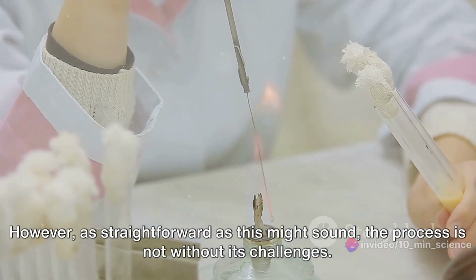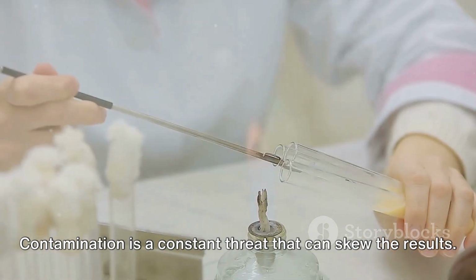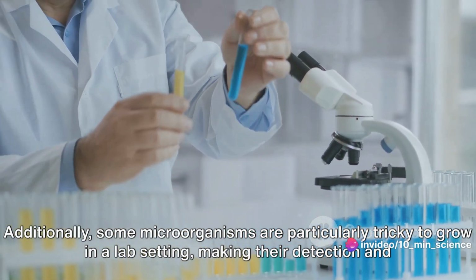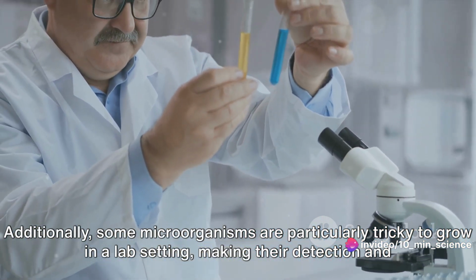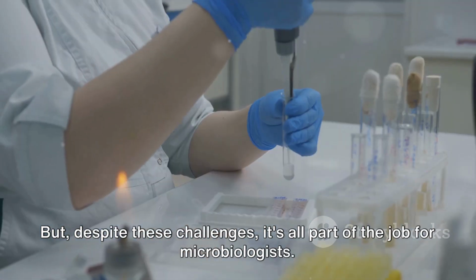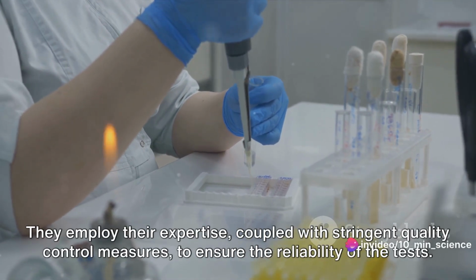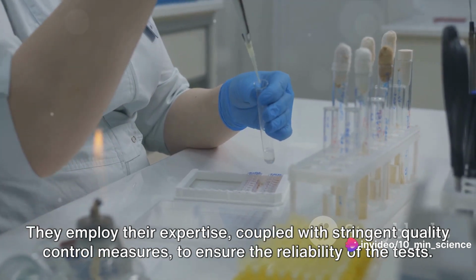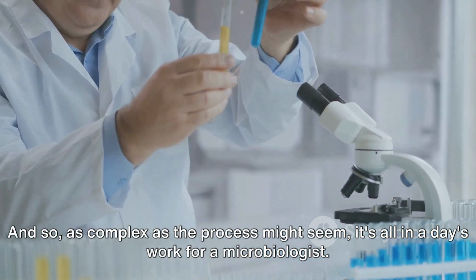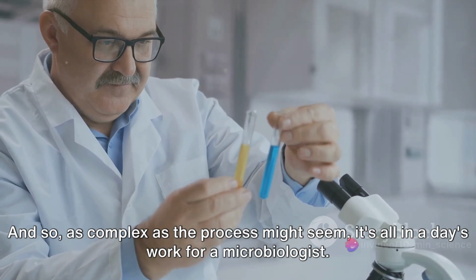However, as straightforward as this might sound, the process is not without its challenges. Contamination is a constant threat that can skew the results. Additionally, some microorganisms are particularly tricky to grow in a lab setting, making their detection and identification a daunting task. But despite these challenges, it's all part of the job for microbiologists. They employ their expertise, coupled with stringent quality control measures, to ensure the reliability of the tests. And so, as complex as the process might seem, it's all in a day's work for a microbiologist.